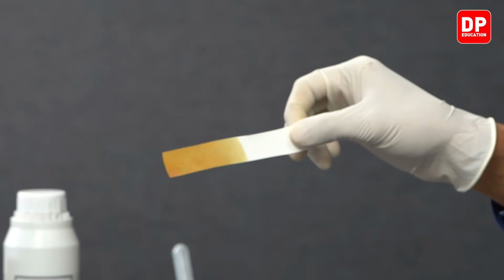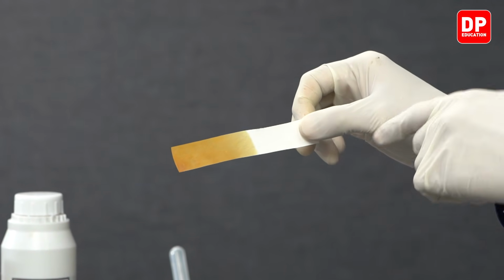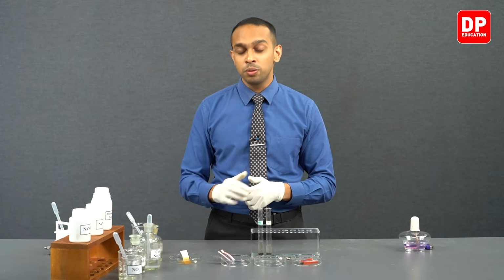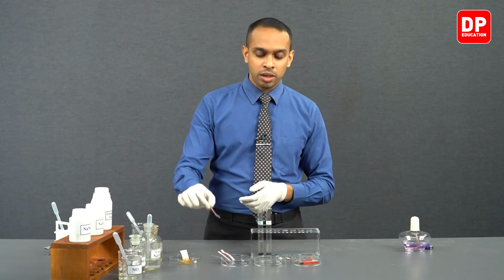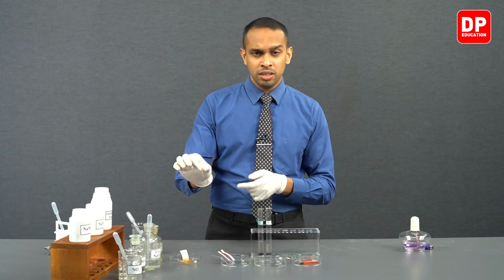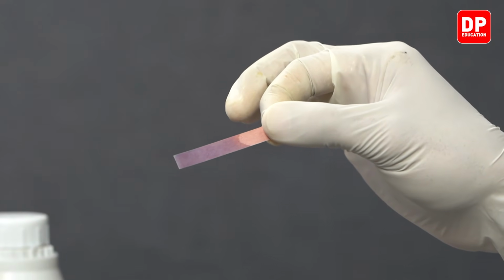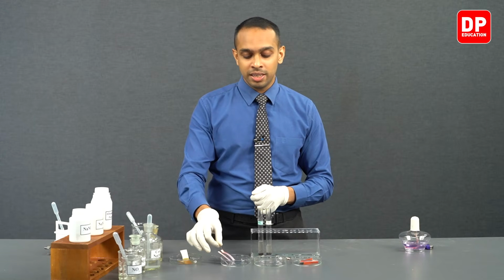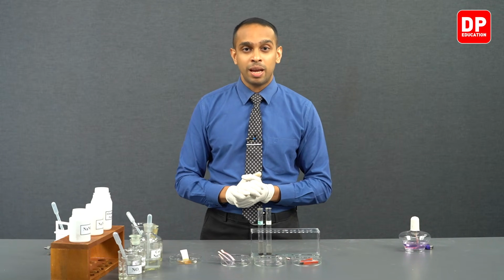We know when ammonia is present, Nessler's reagent will turn to a brown color. We observe that ammonia turns Nessler's reagent to a brown color. With this observation we have here, the filter paper soaked in Nessler's reagent turned brown when we exposed it to ammonia gas that is released. And apart from that, we also confirmed that it was a basic gas that is released with the use of a red litmus paper that is soaked in water. So it turns to a blue color, indicating that the gas released was a basic gas and is in fact ammonia.